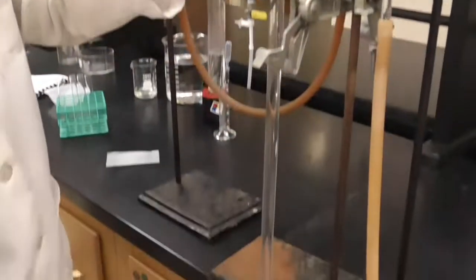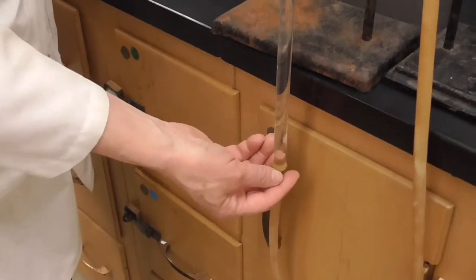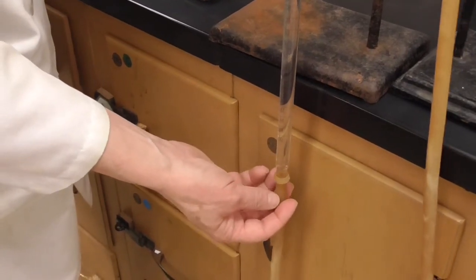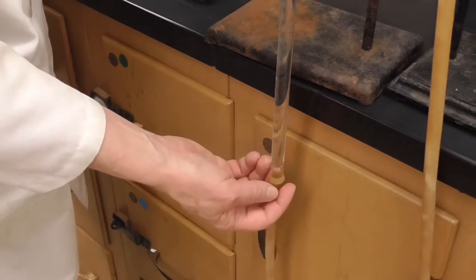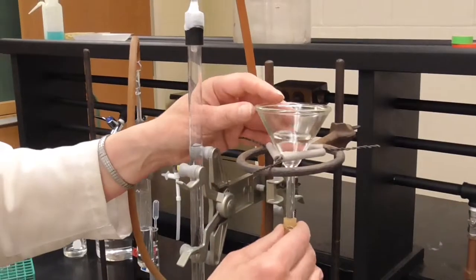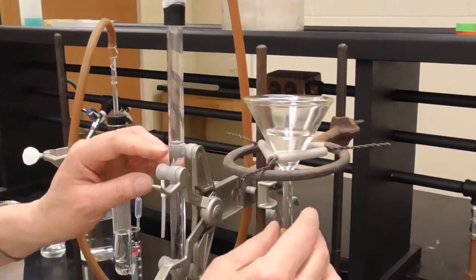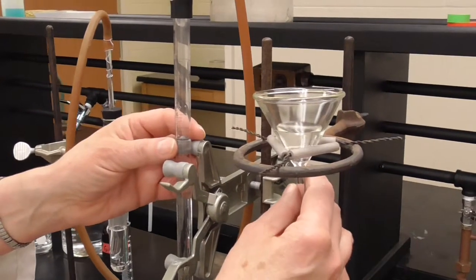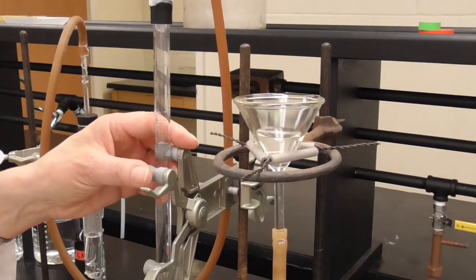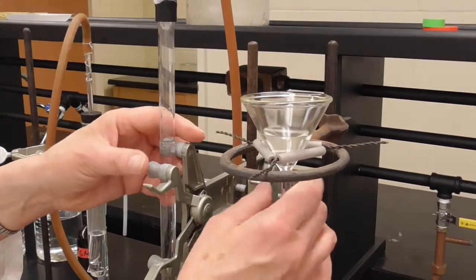We have a burette, and at the bottom of the burette we've removed the burette tip, and we now have tubing that is connected directly to that, and that tubing then is connected to the bottom of a funnel.